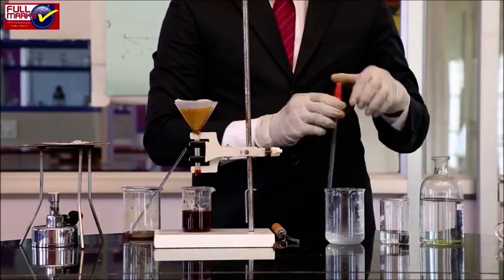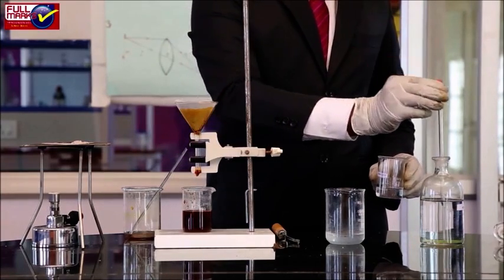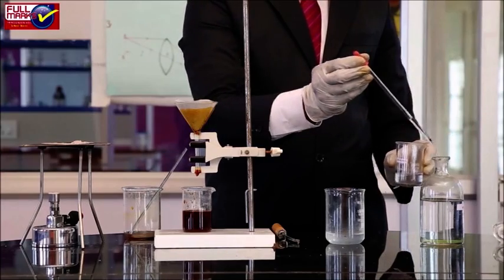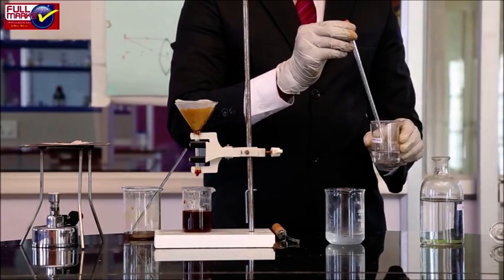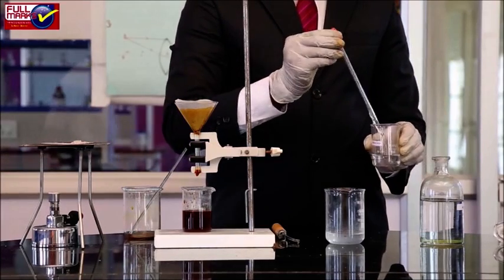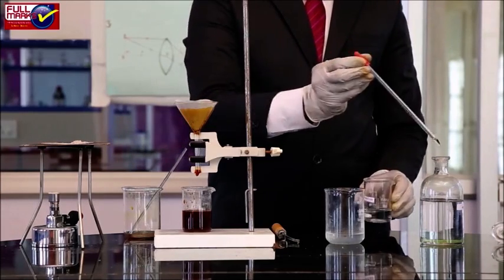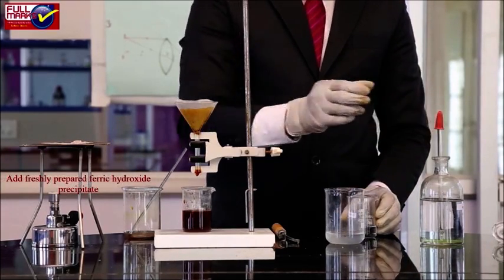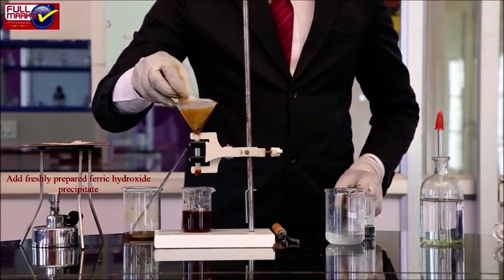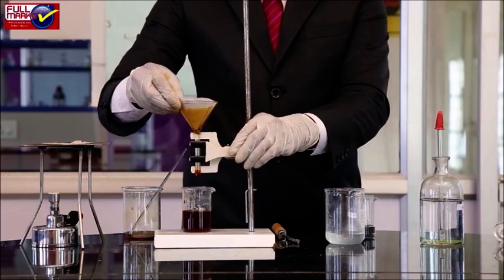Preparation of potassium trioxalatoferrate(III): In a clean 250 ml beaker, take 4 grams of hydrated oxalic acid and 6 grams of hydrated potassium oxalate. Dissolve them in 100 ml of distilled water by stirring with a glass rod. Add the freshly prepared ferric hydroxide precipitate in small amounts to the above solution with constant stirring.